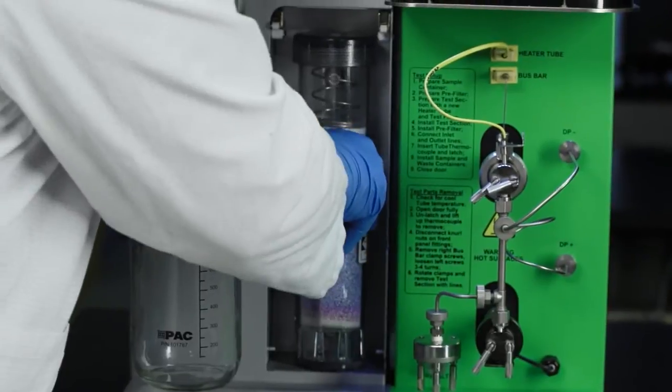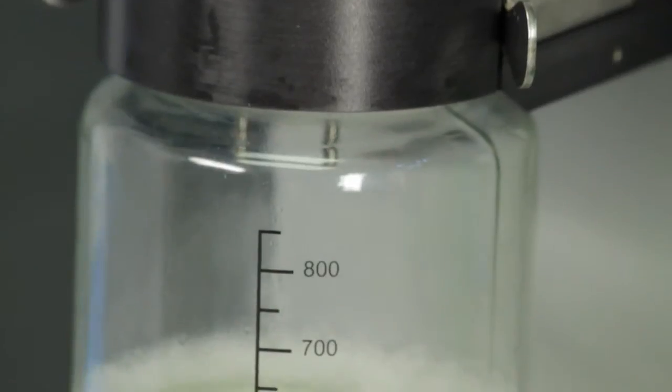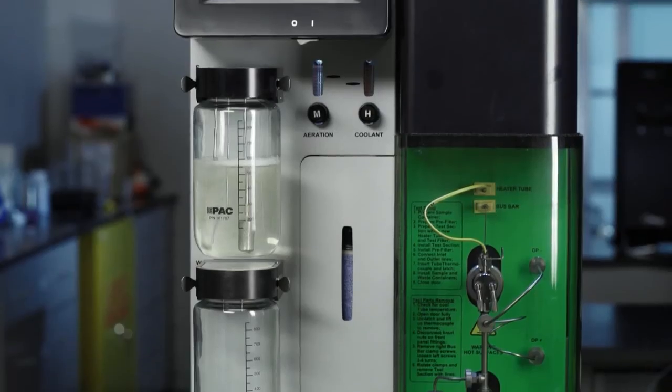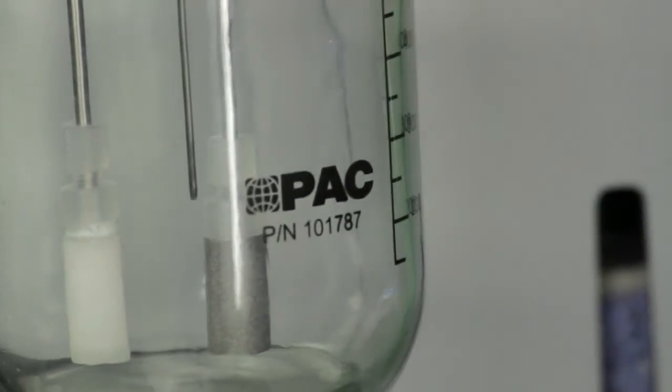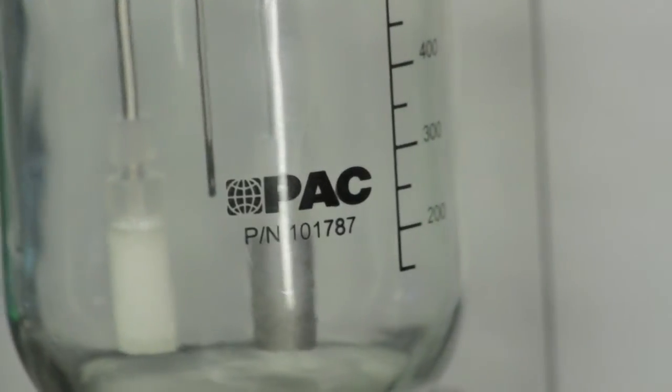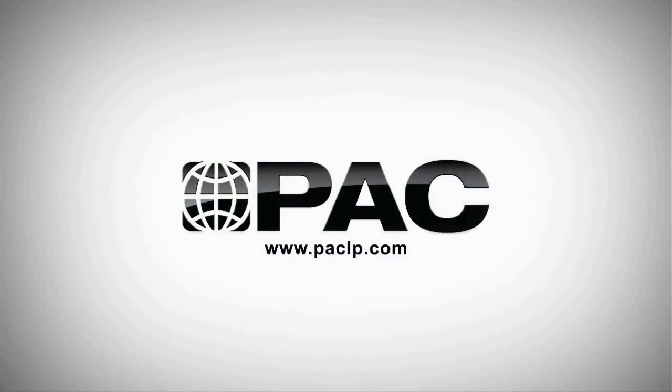Features like the QuickConnect dryer canister, tool-less fasteners and automatic line flushing make it easier and safer for you to use. The design was not only based on our 40 years of industry-leading experience, but also on input from customers like you. Visit www.paclp.com for the latest information or to contact an expert.